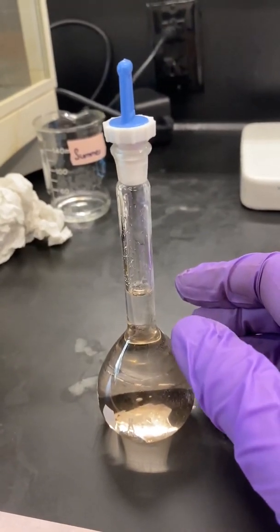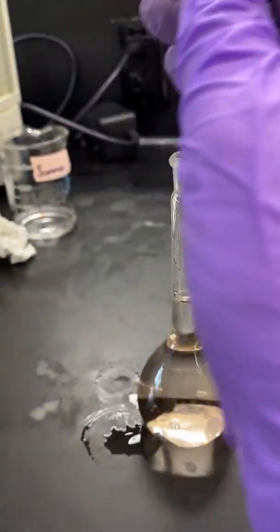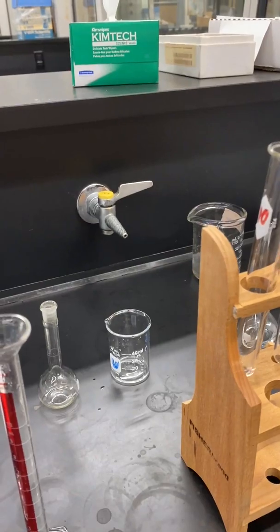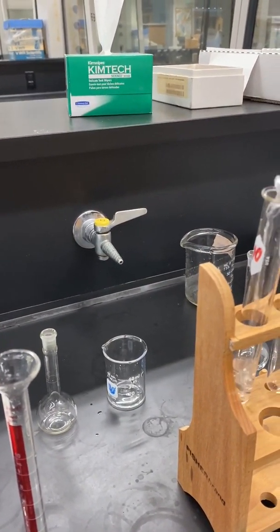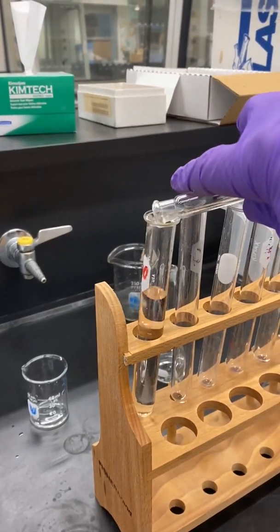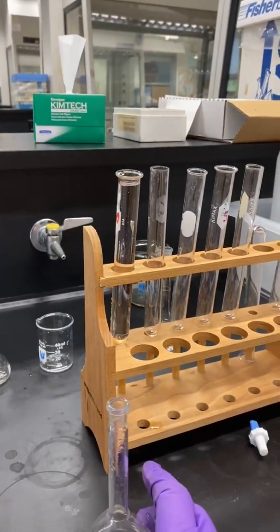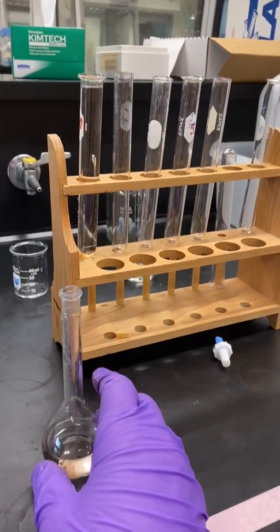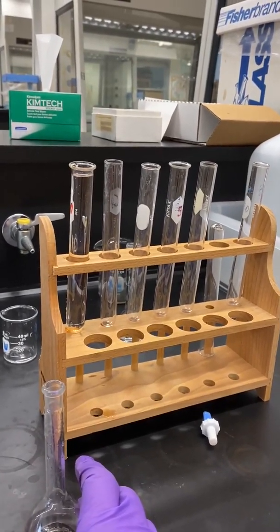Once we've filled the volumetric flask to the mark with distilled water and mixed it well, we can transfer solution A to a clean, dry test tube. You do not need all of the solution in the volumetric flask — just fill the test tube near the top. This will be enough for the spectrometer.